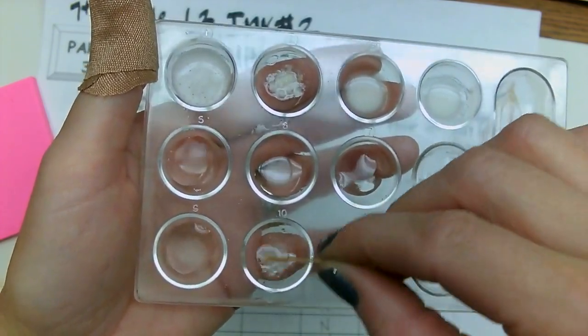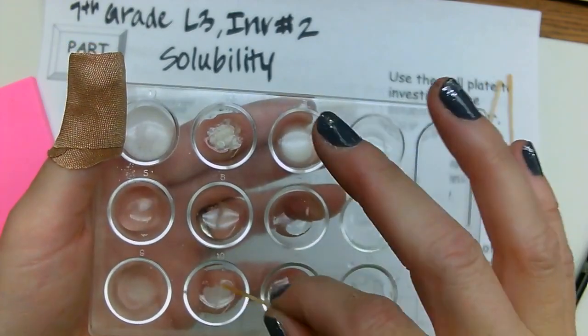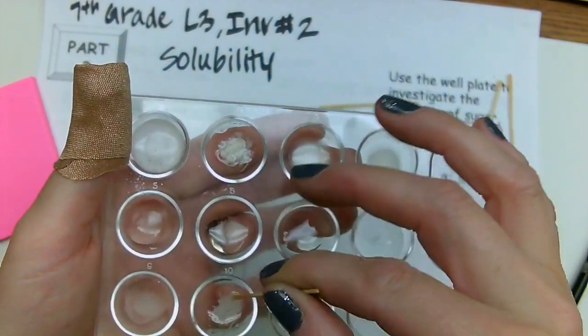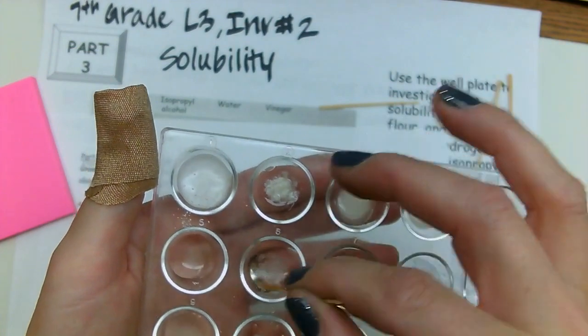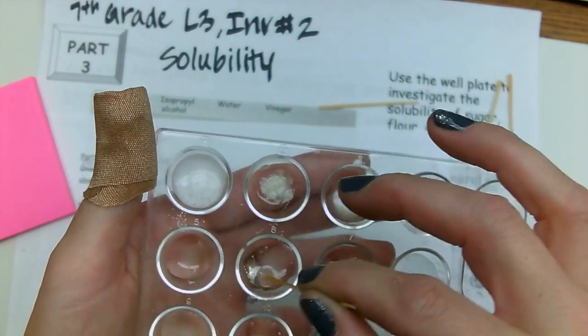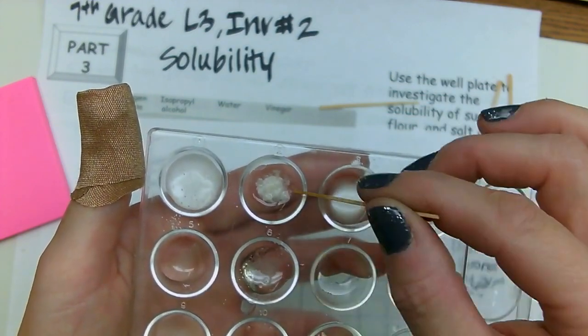It's not dissolving very well. And if you compare it, after I stir it a while, I really don't see a change here in the amount of salt. I still see a lot of salt. And then sugar, I don't see a big change here in the sugar. Still pretty grainy, like with the mineral oil.